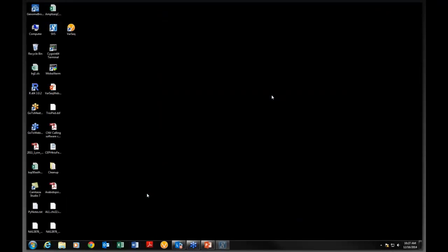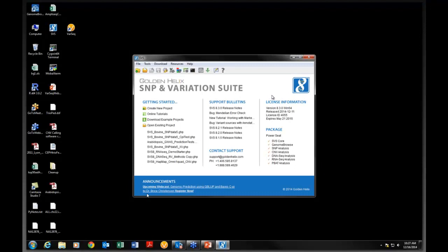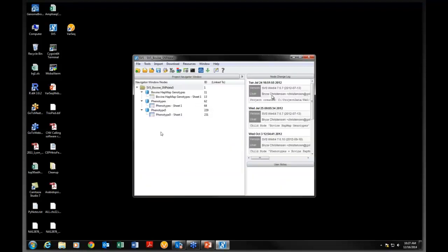So we'll go ahead and launch SVS. I expect that many of you have seen it before. If not, just for orientation, I'll point out that when you launch the software, you are prompted either to create a new project, download example data to work with, look at tutorials if you're just getting started, or you can open an existing project. And that's what I'll do today, is open a project where I already have some data.